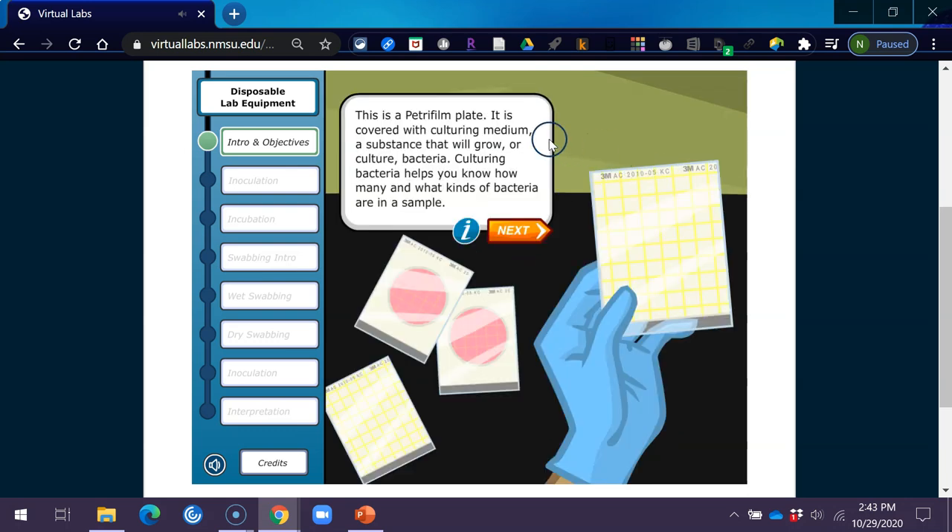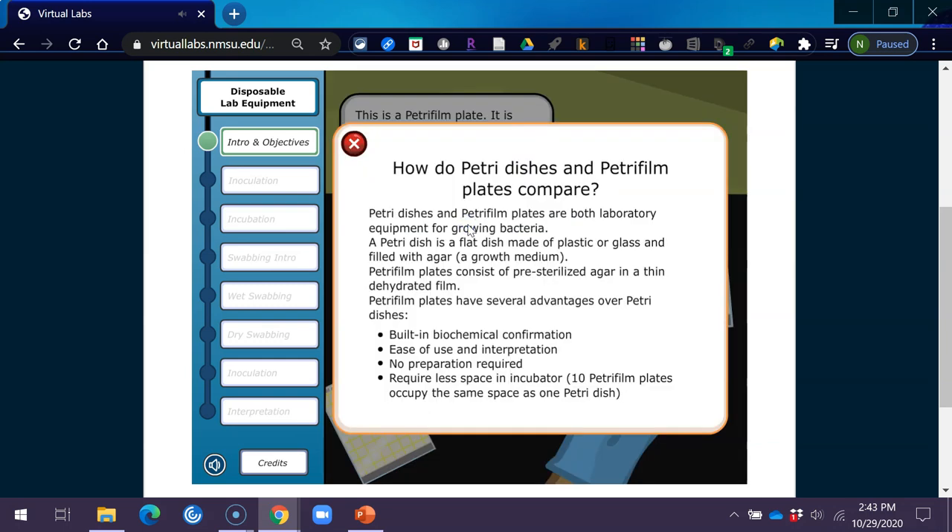This is a Petri film plate. It is covered with culturing medium, a substance that will grow or culture bacteria. Culturing bacteria helps you know how many and what kinds of bacteria are in a sample. Petri dishes and Petri film plates are both laboratory equipment for growing bacteria. A Petri dish is a flat dish made of plastic or glass and filled with agar, a growth medium. Petri film plates consist of pre-sterilized agar in a thin, dehydrated film. Petri film plates have several advantages: built-in biochemical confirmation, ease of use and interpretation, no preparation required, and they require less space in the incubator — 10 Petri film plates occupy the same space as one Petri dish.